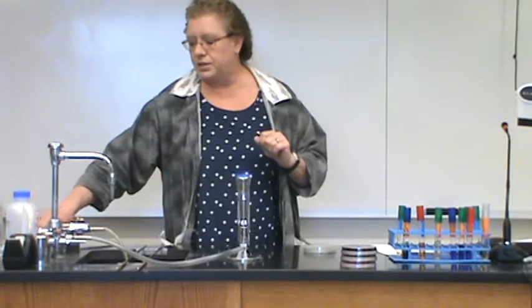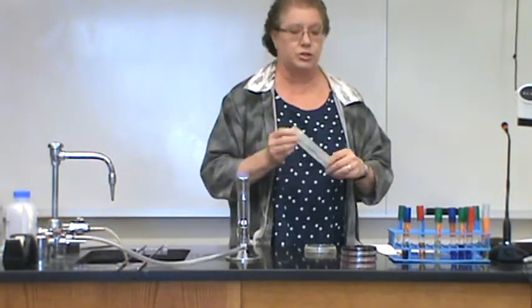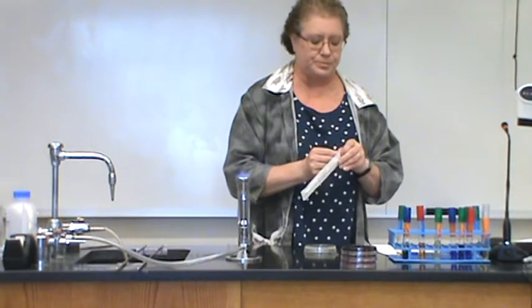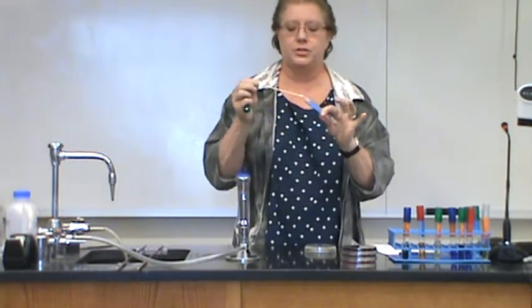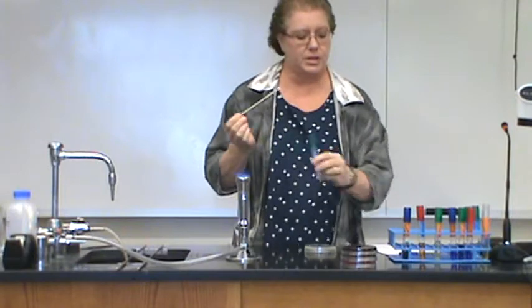So how do we inoculate this? Well, this requires some heavy growth to see the hydrolysis really clearly. So again, we're going to use a sterile swab. Remove your swab, pick up your unknown. It's unknown number 1, remember, we're still doing that. Flame the top, moisten your swab, flame the top.